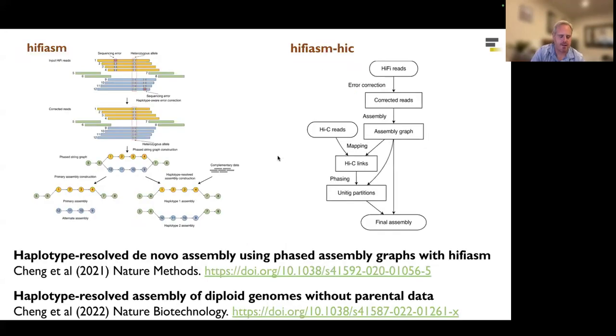And then finally, the last part is to say a little bit about the algorithms. These days, there are a variety of algorithms available for HiFi data and for Oxford Nanopore data. For HiFi data, the leading assemblers include something called HiCanu that I referenced a minute ago, and another assembler called Verkko. But for general HiFi-based assembly, a really good assembler, very fast and giving you very accurate assemblies, is called hifiasm, developed in the lab of Heng Li at Dana-Farber and Harvard.